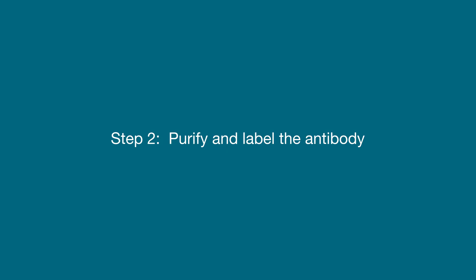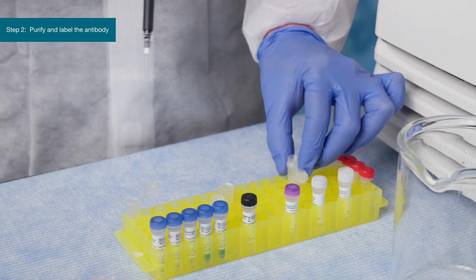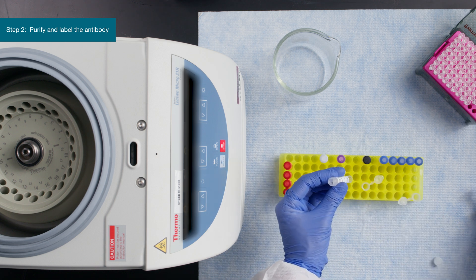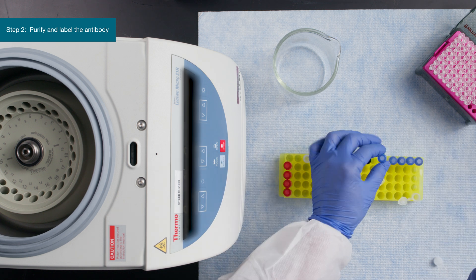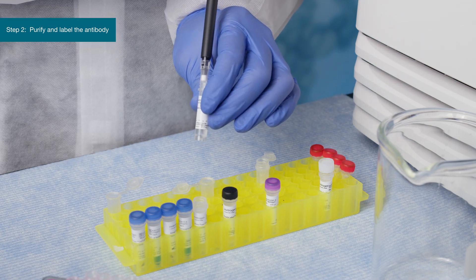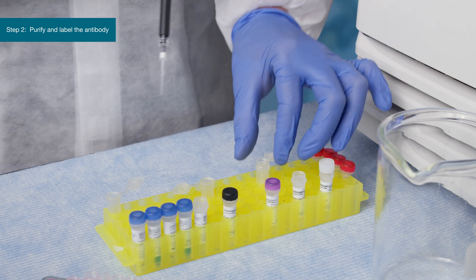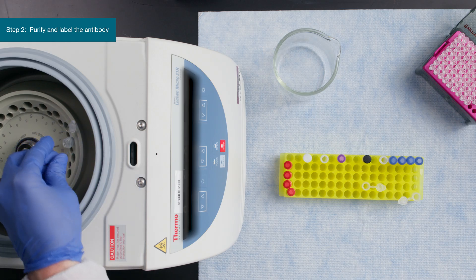The second step is to purify and label the antibody. Load 20 micrograms of antibody solution onto the washed resin in the column. Centrifuge at 200 Gs for 5 minutes or until no liquid remains. Dissolve the Reactive Dye in DMSO by adding 2 microliters of DMSO to a vial of lyophilized dye and pipette it gently. Next, dilute the dissolved dye with 18 microliters of labeling buffer. Immediately add 15 microliters of the diluted dye onto the resin. Centrifuge at 200 Gs for 5 minutes and discard the flow-through.